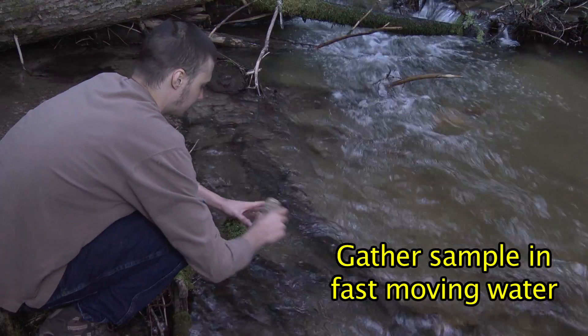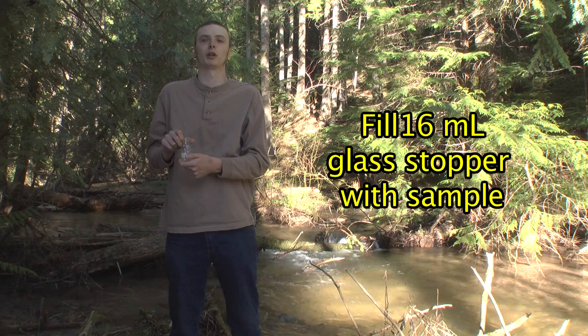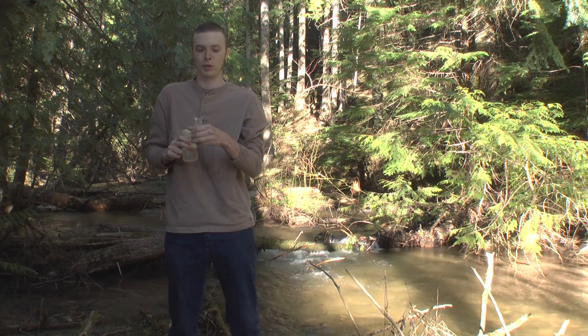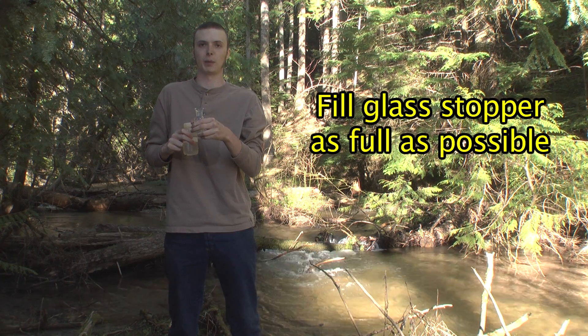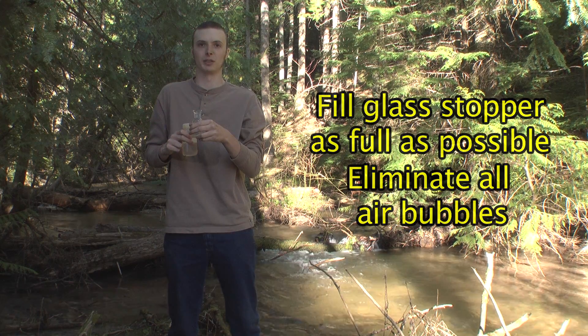When gathering your water sample, you want to gather a sample in fast-moving water. This is a 60-milliliter glass stopper bottle. You will fill this up with your water sample — you want to fill your glass stopper bottle overflowing with water, then put your stopper into it and remove any excess water. It's very important to eliminate any air bubbles that you can.